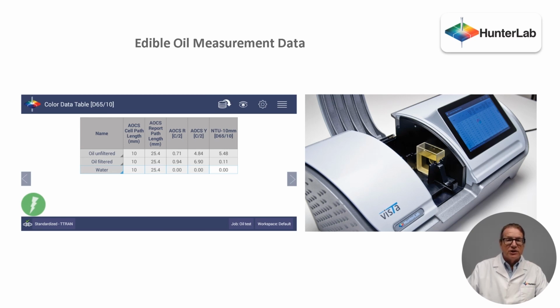The precision statement and results for this method are now 26 years old. They do not include modern instruments that employ a spectrophotometer to measure the color. Users would benefit from a global study showing that spectrophotometers can reproduce the same results as visual colorimeters and visual comparators. It's time to revisit the current AOCS method.